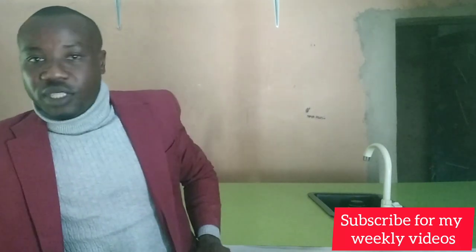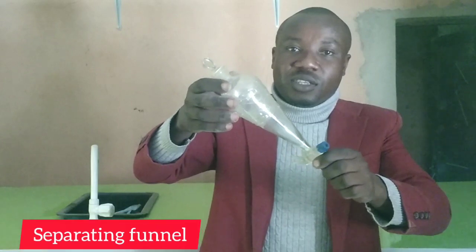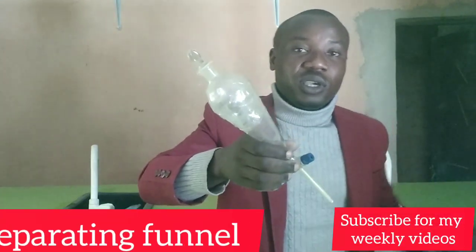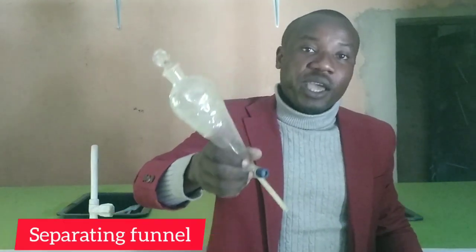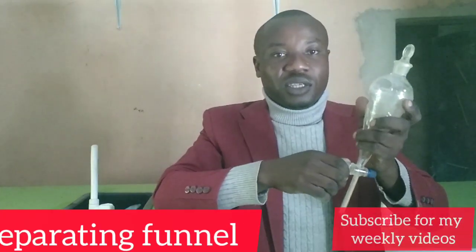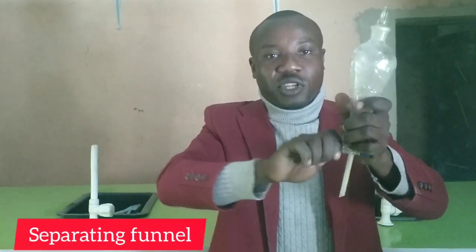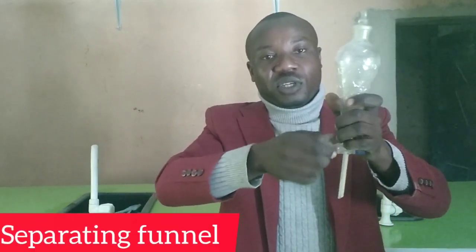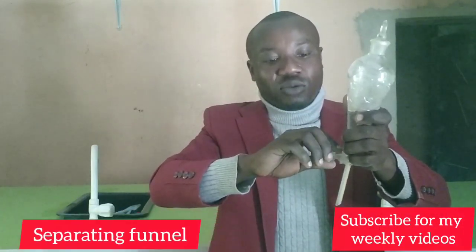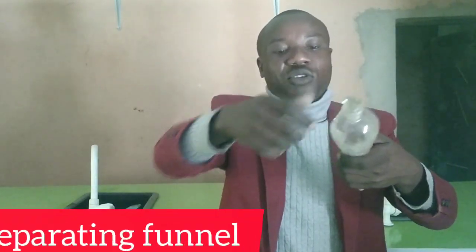As I'll be showing you separating funnel. This is what we call separating funnel. So in one of my class, the student just destroyed. This is what we call separating funnel. We use the separating funnel for immiscible liquids like oil, like red oil and water, for example, that do not mix. By the time you pour it inside, you see the separation will surely take place. Now this is the tap. You just open the tap. So one of the solvents will come down. Then when the second one is trying to come down, you can now lock it. So it has a cover here. So you pour it through that side.